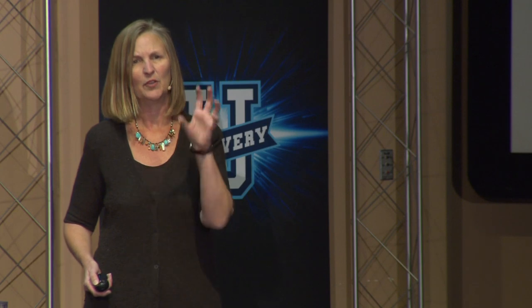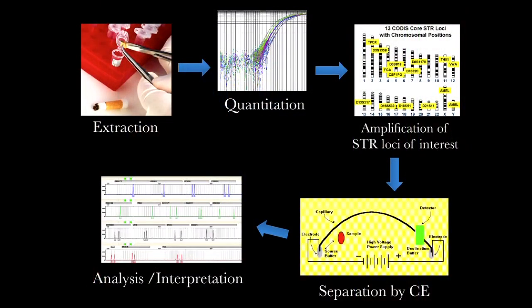I had a case involving chewing gum, and I was able to get the DNA cells from that and process the DNA. Now, the PCR test that we use involves the extraction of DNA, quantitation. It involves several steps, just like RFLP does. But what we do now is go in and target short tandem repeat areas, smaller repeat areas, similar to the larger fragments that Dr. Alec Jeffreys looked at. These are much smaller.